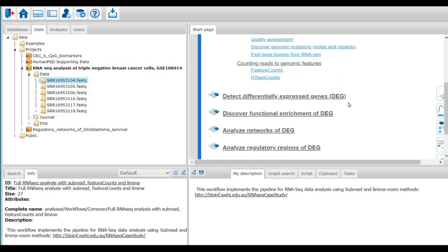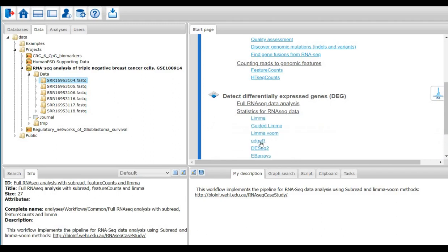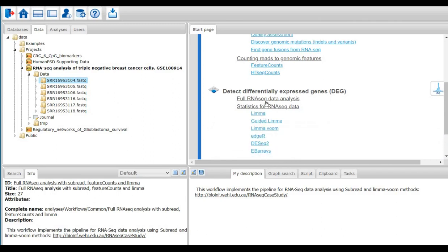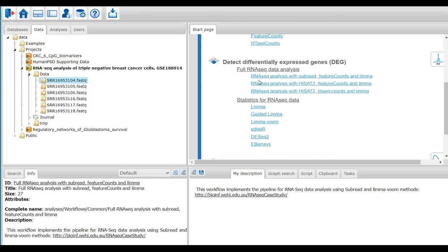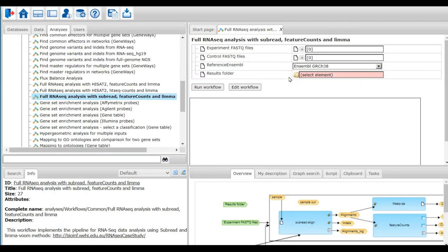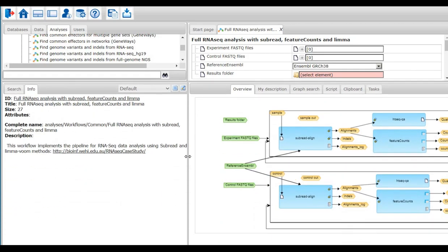Under detect differentially expressed genes, there are a lot of statistical methods to calculate the log fold change and p-value. Also, the GeneXplain platform provides several pre-existing workflows which take FASTAQ files and output a list of differentially expressed genes. Here I am using one such workflow to analyze the FASTAQ files, the one with subread and limma.